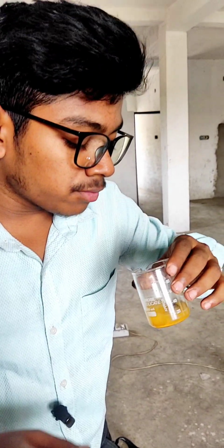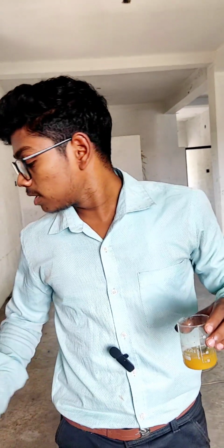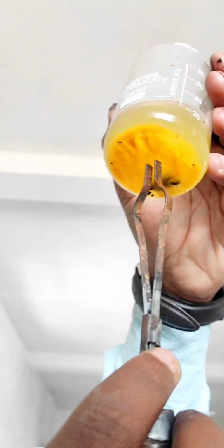So this is the third beaker, and we have taken ferrous sulphate solution and we added a zinc granule. As we know, zinc is more reactive than ferrous, so it displaces the ferrous in ferrous sulphate solution and makes the solution zinc sulphate. You can see the ferrous precipitate is settled down. So this shows that zinc has displaced ferrous from the ferrous sulphate solution.